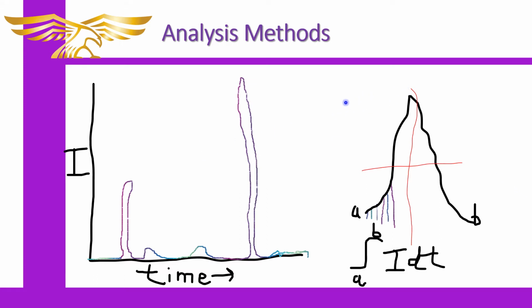Now, if you were to be given a strip chart, instead of being given a report printout that gave you the area under the curve, which is how you determine the mole relationships of what is present in the sample, we can correlate the area under these curves to the molar relationship in the sample mixture. And we do that by taking it as a fraction of the total areas under the curve versus the area under the specific curve. So instead of using mole, you use the area. So area over total area is the mole fraction for that particular compound in the sample.